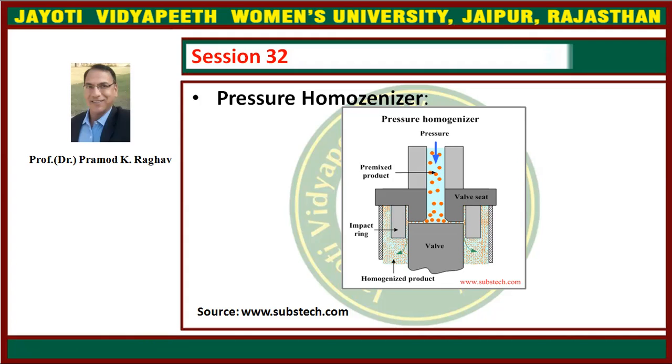This high velocity and then drop of velocity produces turbulence, and that produces shearing force, which is enough to reduce the size and create more and more particles of the dispersed phase. That leads to homogenization. That's how the pressure homogenizer works.